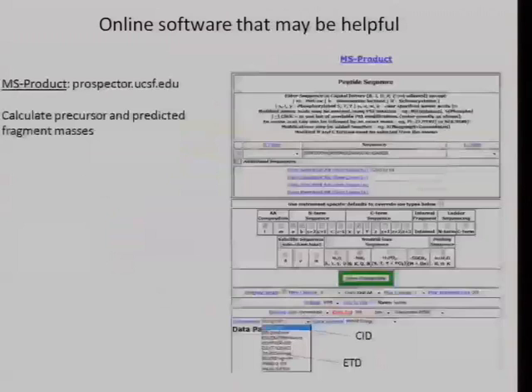Is there any limit for the structure you can identify? For example, in high molecular mass glycans, I mean lactosamine glycans. After you have the complex glycan, then you can have lactosamines. Or gal 1,3 bonded galactose. You can identify those glycans? In theory, you should be able to. If you see the precursor peak, you should be able to work it out on the basis of the mass.